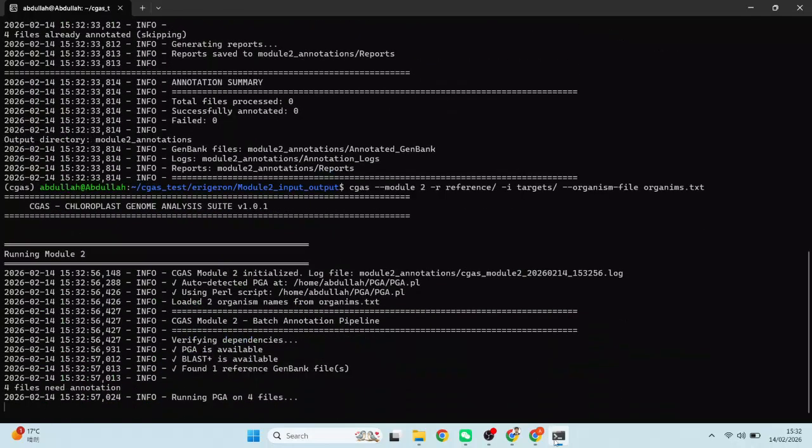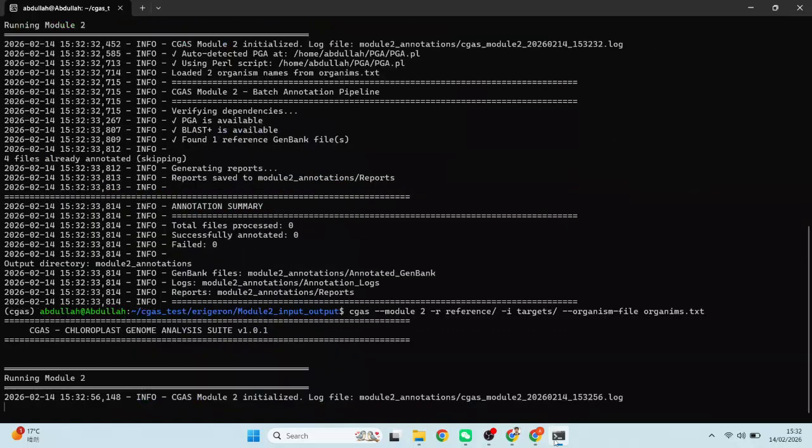Now we will run the PGA. Now when the PGA is completed, it will provide the complete result to us.